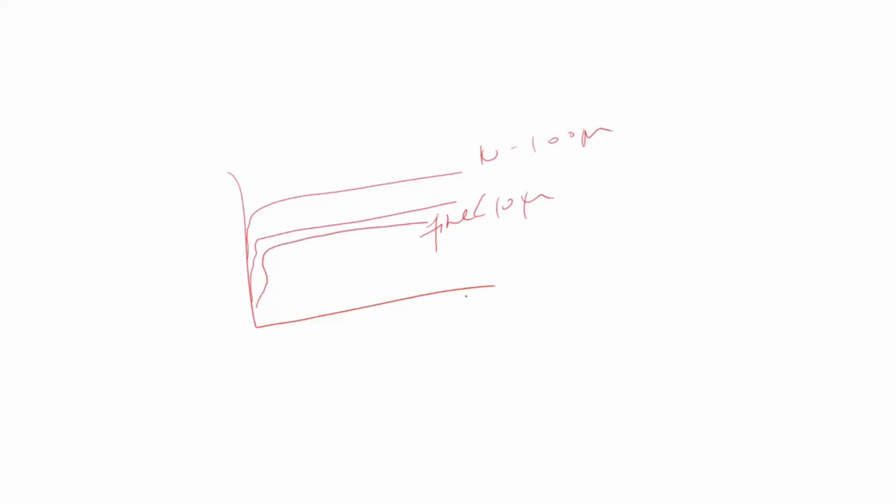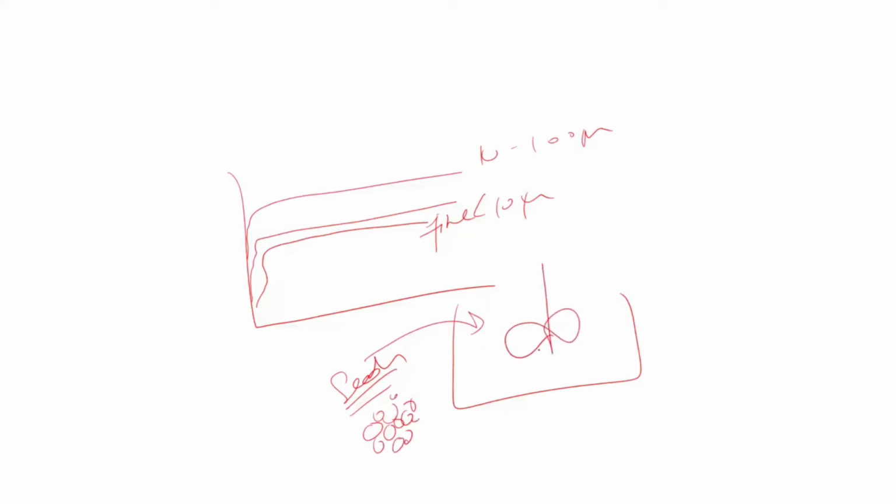And normally that happens because when we seed the crystallizer, the seeds will be clubbed together. We call them slightly agglomerated, and then once it goes through agitation, it will become single particles due to the shear force created by the impeller. So after a few minutes, you will see the real counts.